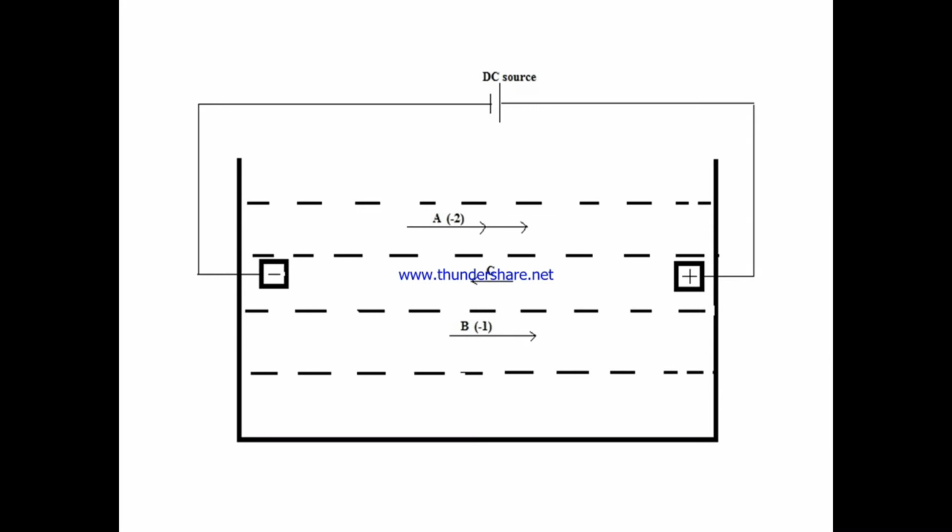In this figure, you can see a charged particle migrates towards the oppositely charged electrode. In this, arrow A indicates faster movement of a particle bearing a net charge density of -2, arrow B indicates the movement of a particle bearing a net charge density of -1, and arrow C indicates the direction of frictional force.